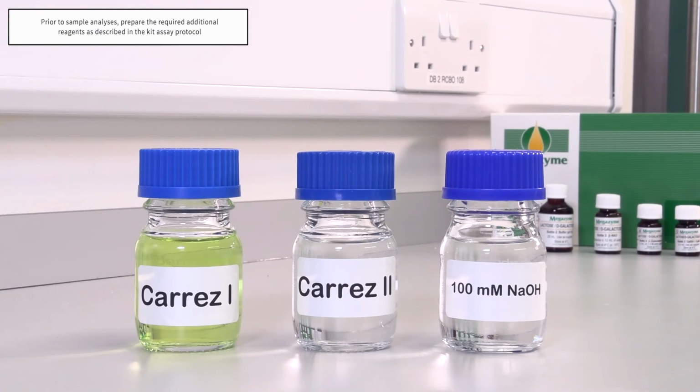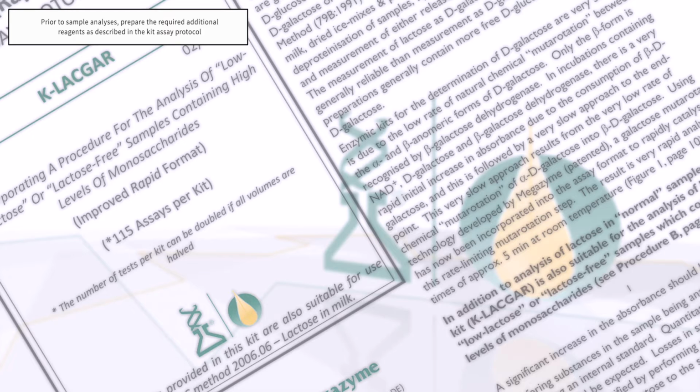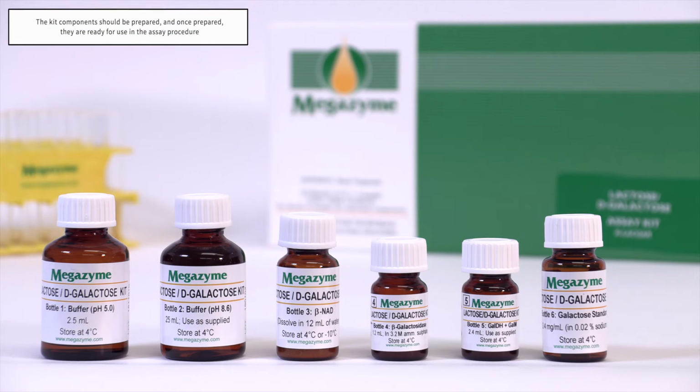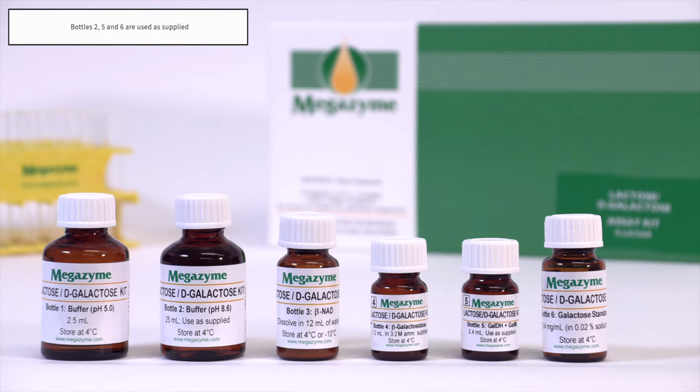Prior to sample analysis, prepare the required additional reagents, as described in the assay protocol. Subsequently, once all of the additional reagents have been made, the kit components should be prepared, and once prepared, they are ready for use in the assay procedure. Bottles 2, 5, and 6 are used as supplied.